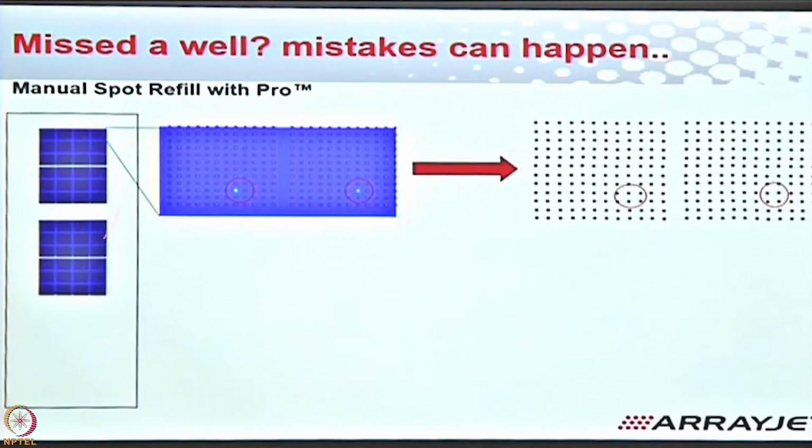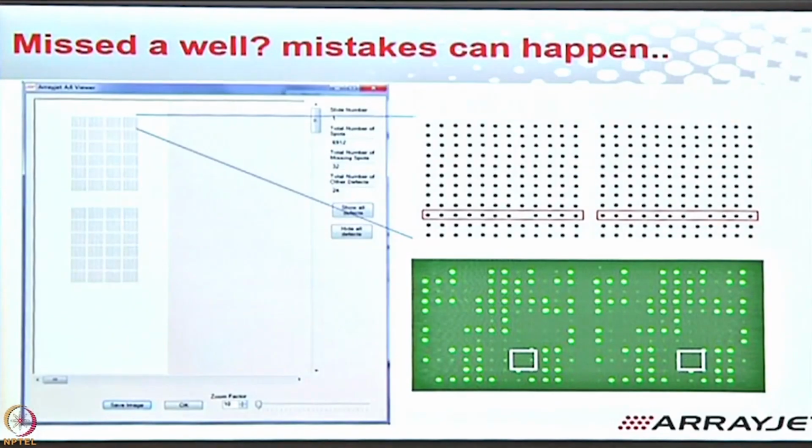And then when I start this overview run, the green area is where it will show me, to confirm and double check, that yes, the antibody that I just refilled is definitely going to get printed. It's not that I'm missing my entire experiment and the whole thing has gone to waste. It'll remember it and show you, just to double check: are you happy with this? Can I start? Can I press yes? You said yes. And then, ta-da, that's it.